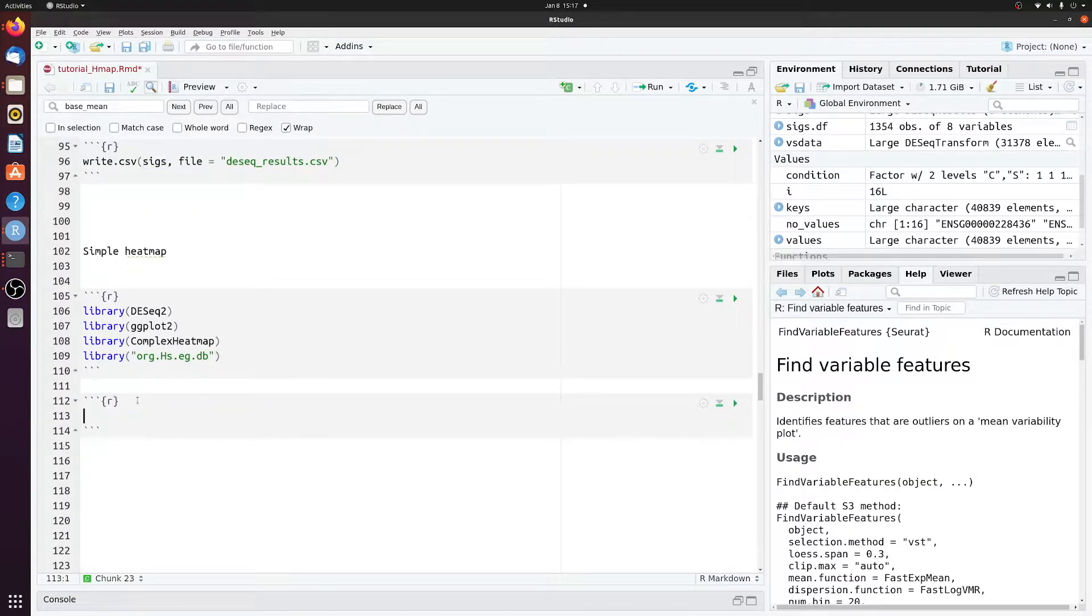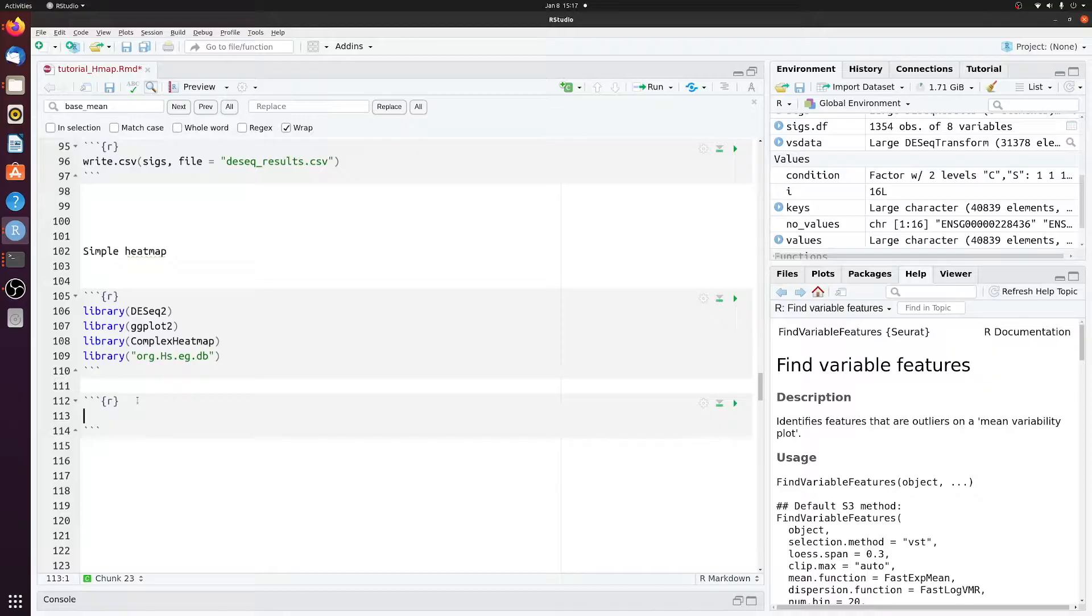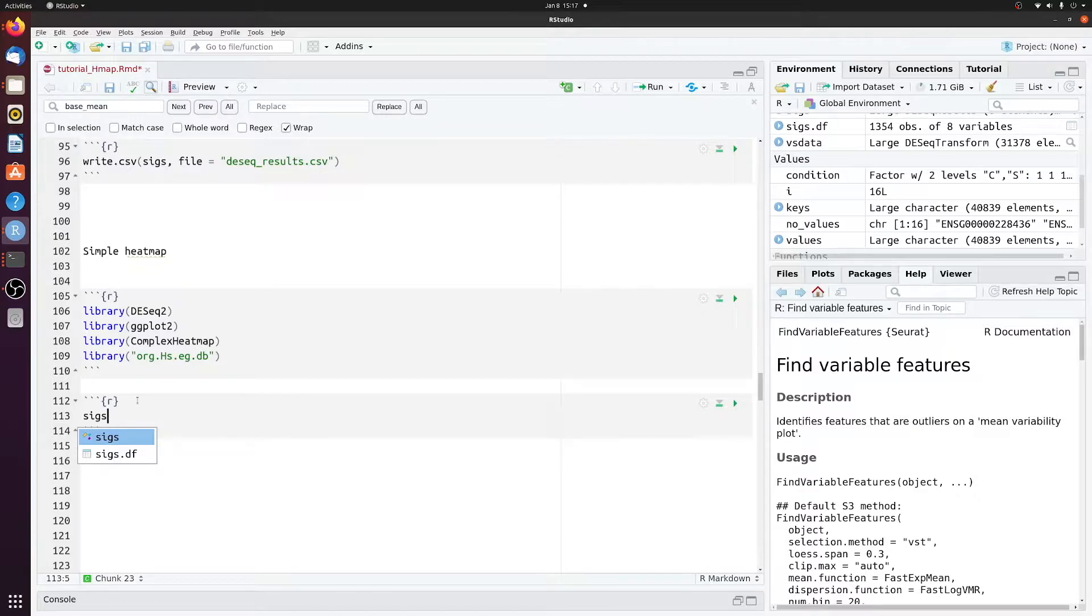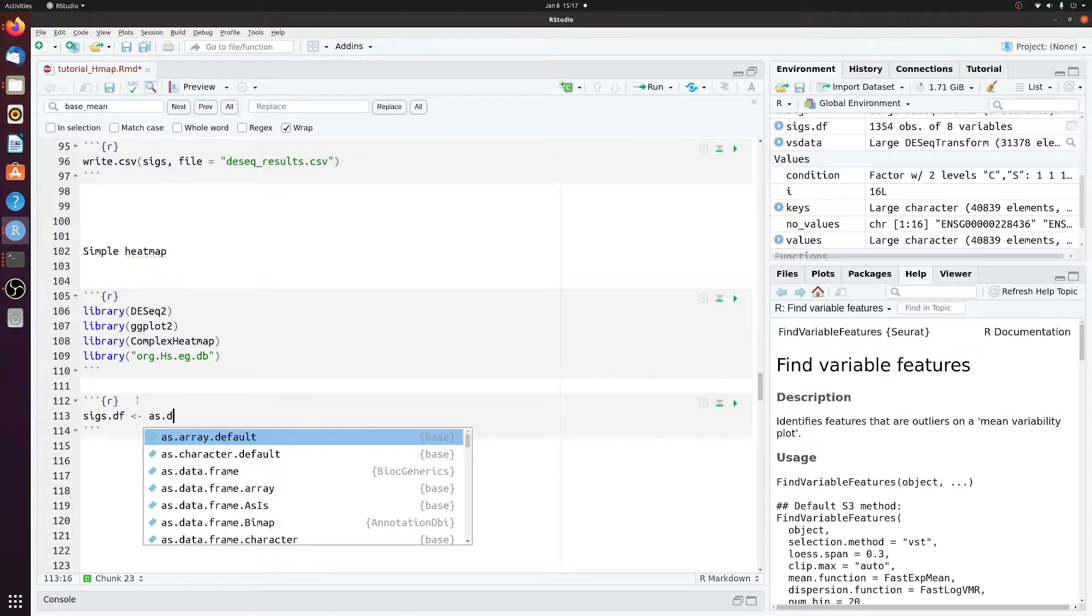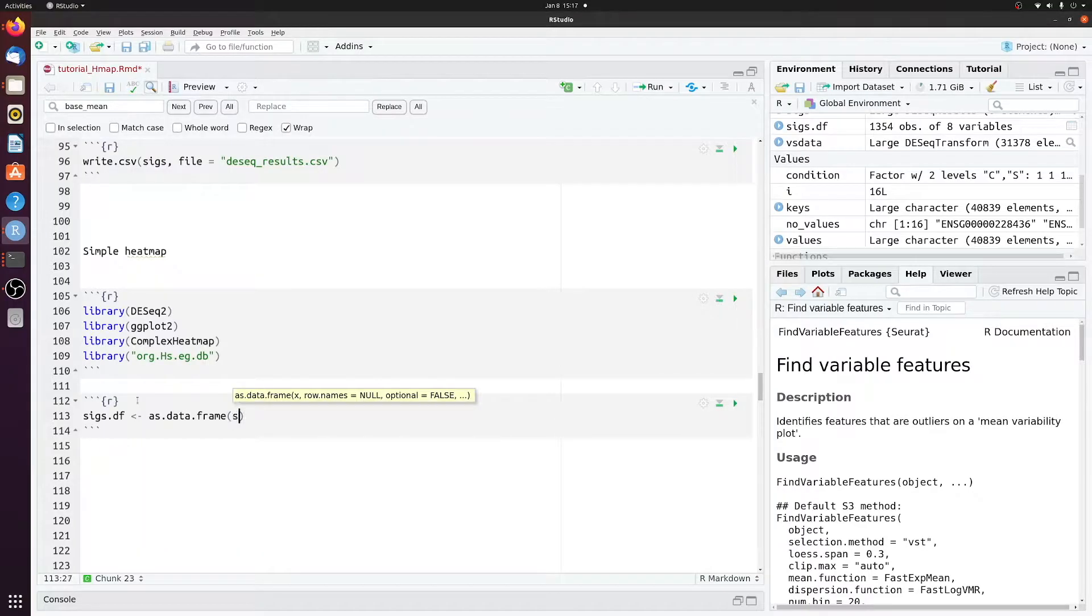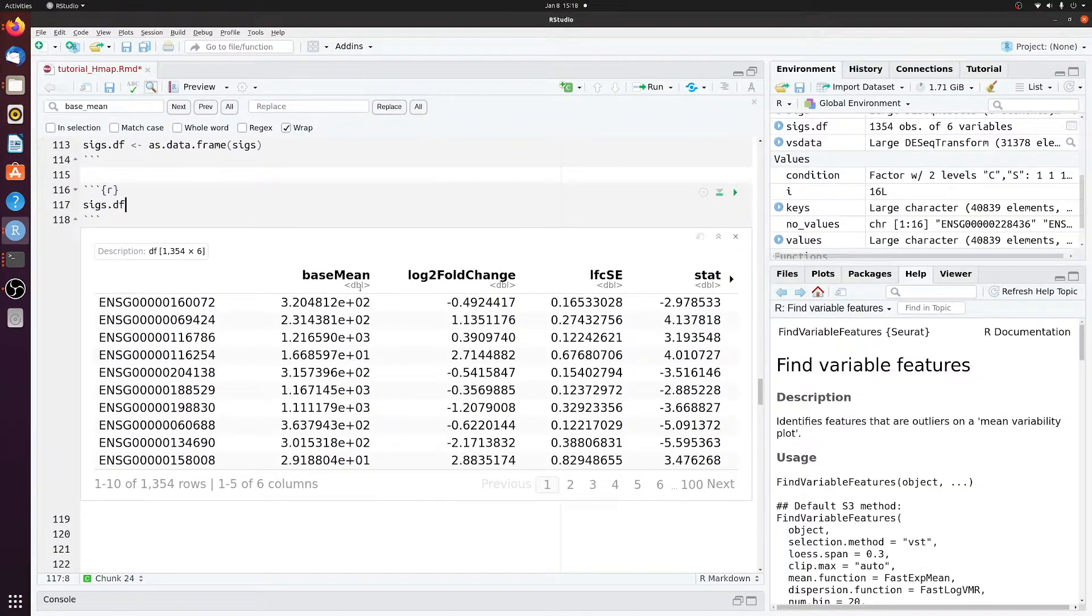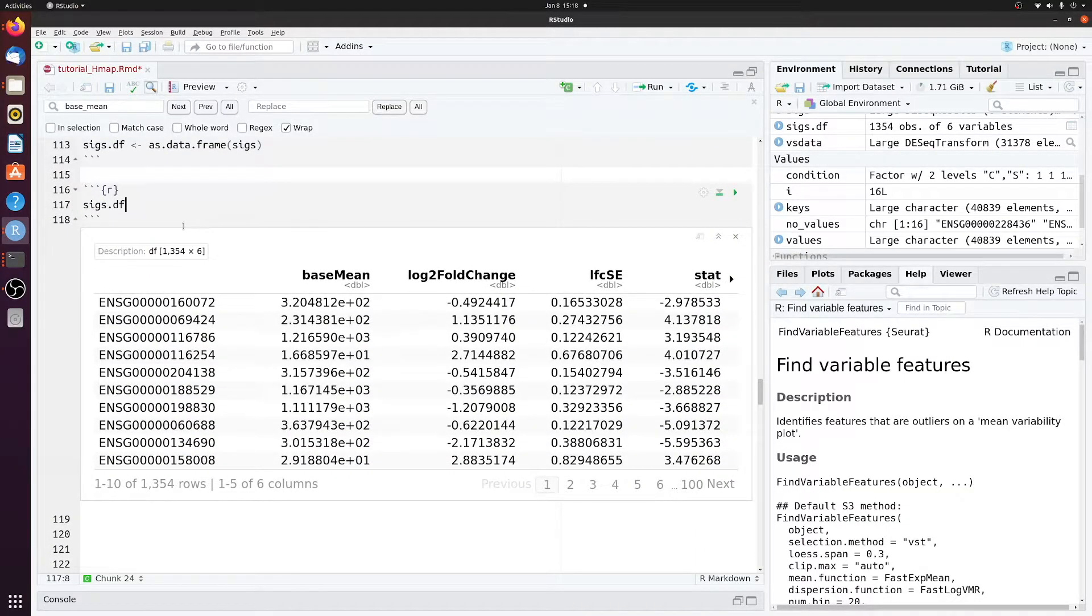So the first thing I want to do is just convert SIGS, that table of differential expression data, to a data frame that we'll call SIGsDF. And if you look at SIGsDF, it's now just that table in data frame format.